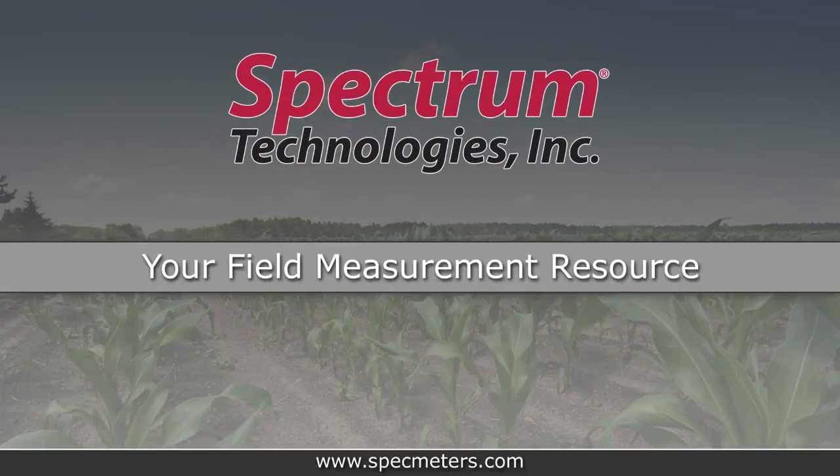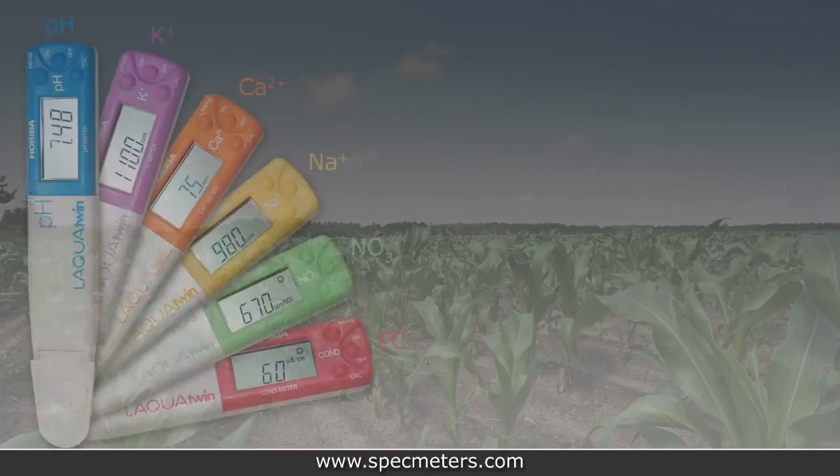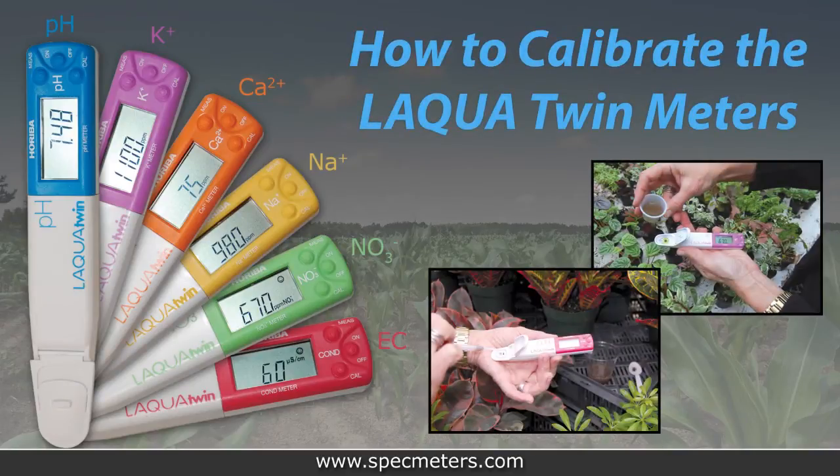Spectrum Technologies, your field measurement resource, presents: How to Calibrate the Laqua Twin Meters.